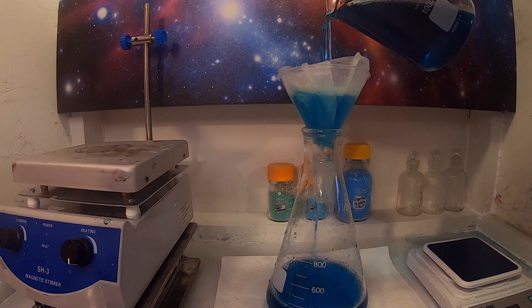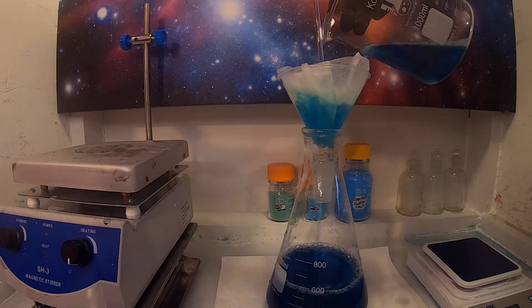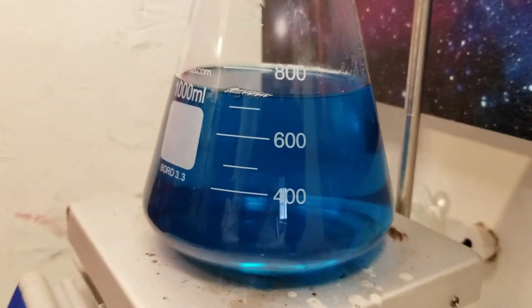Once everything is fully reacted, I quickly filter the liquid, leaving a beautiful clear blue-green copper acetate solution. Isn't that just beautiful? This is why I love copper compounds.